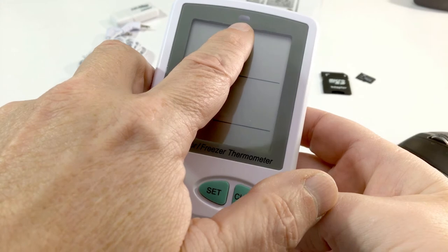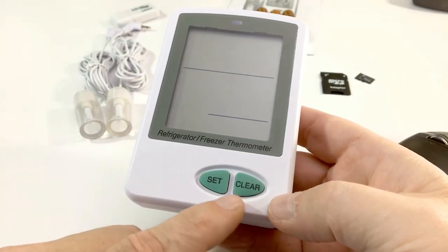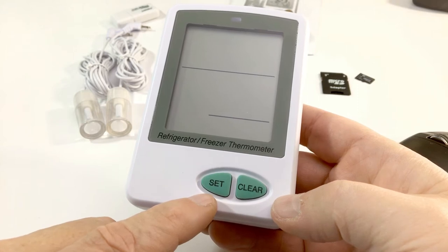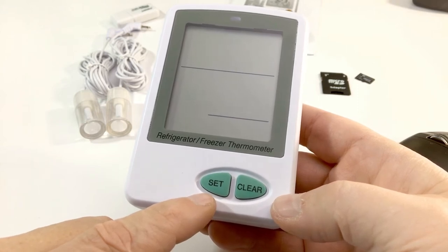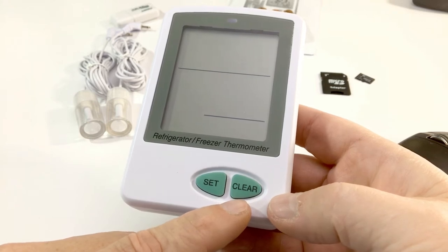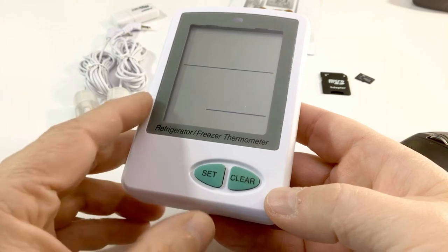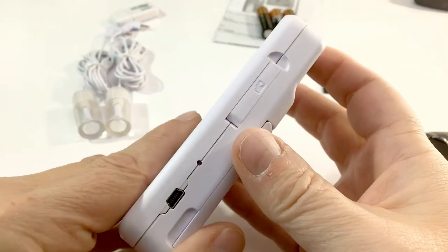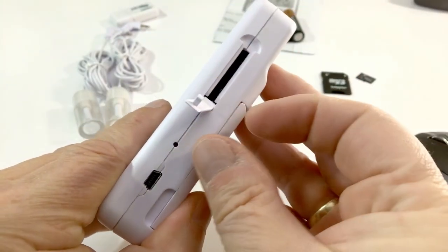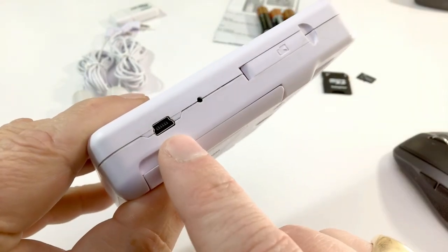Quick overview of the unit. Up top is your LED alarm indicator display and two buttons: Set and Clear. The Set button is used for configuring date, time, and min/max alarm values. The Clear button will reset the min/max recorded values back to the current temperature of the probe. On the right-hand side you have an SD card slot and a USB port for powering and downloading data.